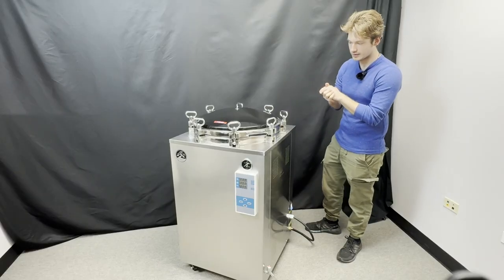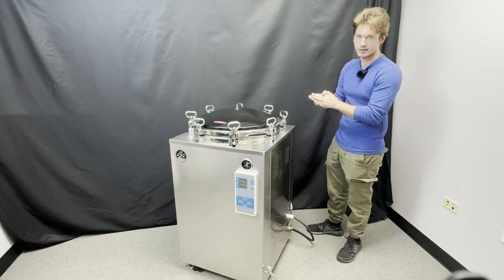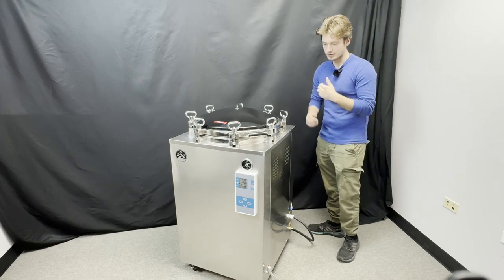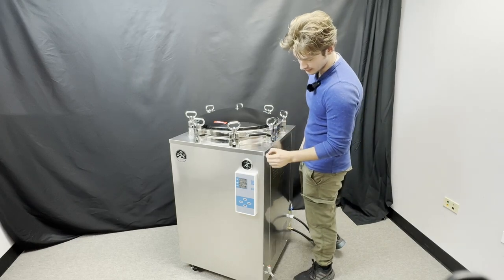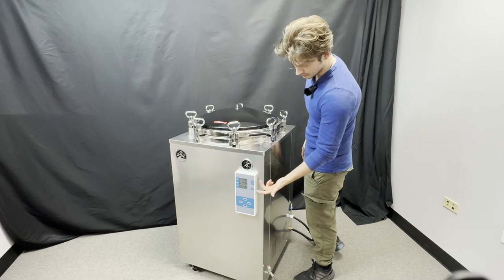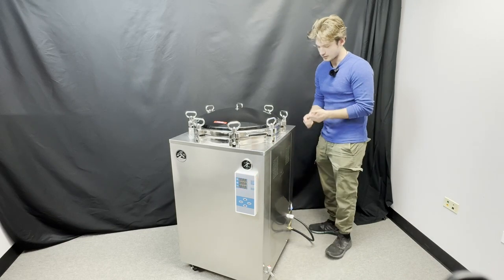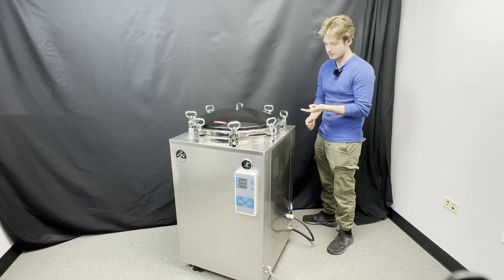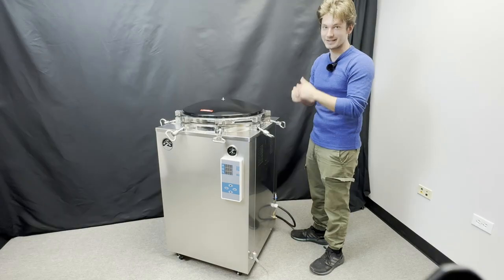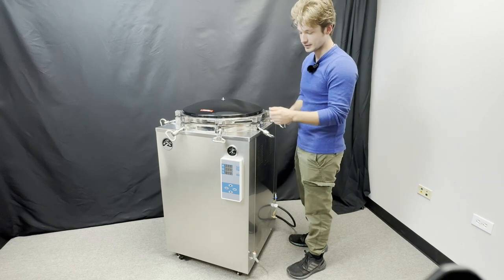Welcome to our introductory video on our 150-liter commercial autoclaves. If you are looking for a set-it-and-forget-it, plug-and-play system, then this is where you need to be. It is a truly customizable system, configurable for both pasteurization and sterilization. All you have to do is set your pressure, temperature, and time. This is suitable for both liquid and solid media substrates.